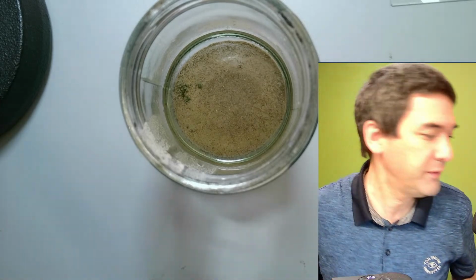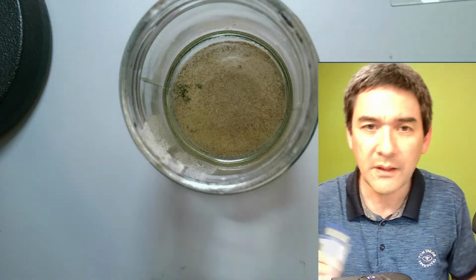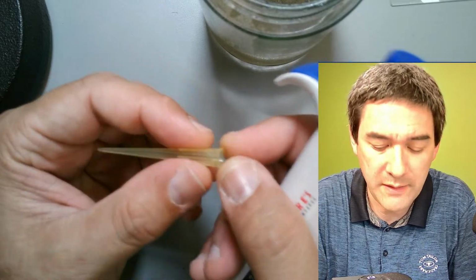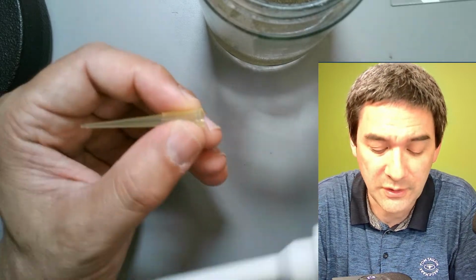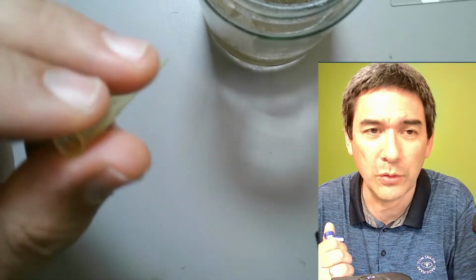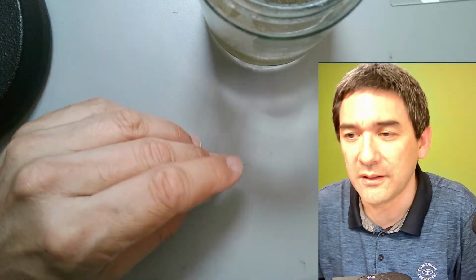No, I don't have the tube here. But the idea was the following. I'm going to quickly explain this. That's actually quite a nice recommendation, thank you. What you do is you have flexible tubing, for example, like the air tubes you sometimes use in aquariums. You connect it over here and the other one over here. Then you have a little bit more control, maybe, because you can keep it kind of separate. This is kind of the idea.